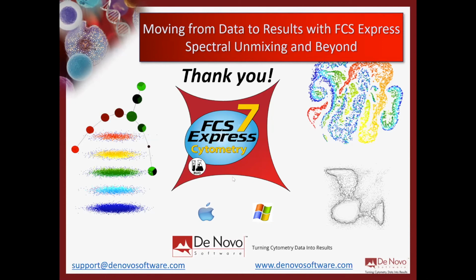Great. So the first question that came through on the Q&A from Yolanda Menke was, don't you need a minimum number of positive events to calculate a good matrix?